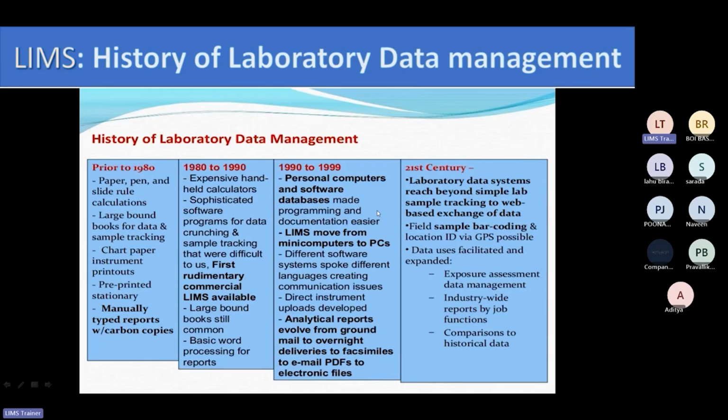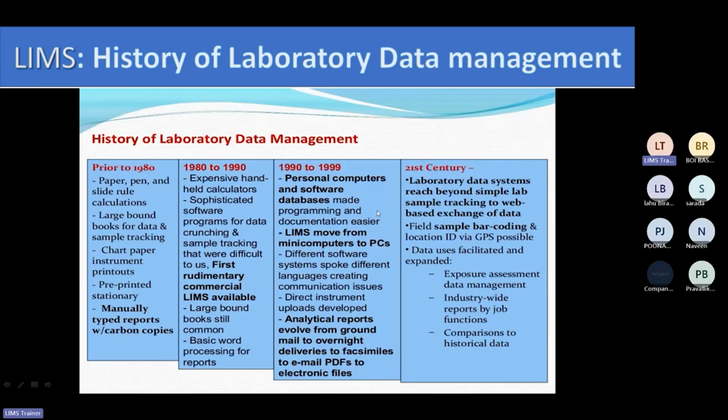After that, the use of personal computers started. Here it became a necessity for the industry to get maximum output from the laboratory in minimal time. That is how information management systems started developing. Whatever information is generated in the laboratory is required to be preserved and recorded, and in that fashion it started developing into computer software. That is how LIMS evolved.